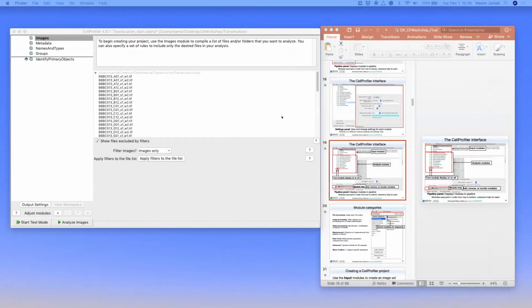Now let's try to figure the settings for these input modules out together. If everybody so far is here. I know that we did have some folks who had some issues unzipping the file, so they may not be able to follow. Okay, then let me briefly explain here, and then you can work together in breakout rooms. Because this is important information I want you all to know.